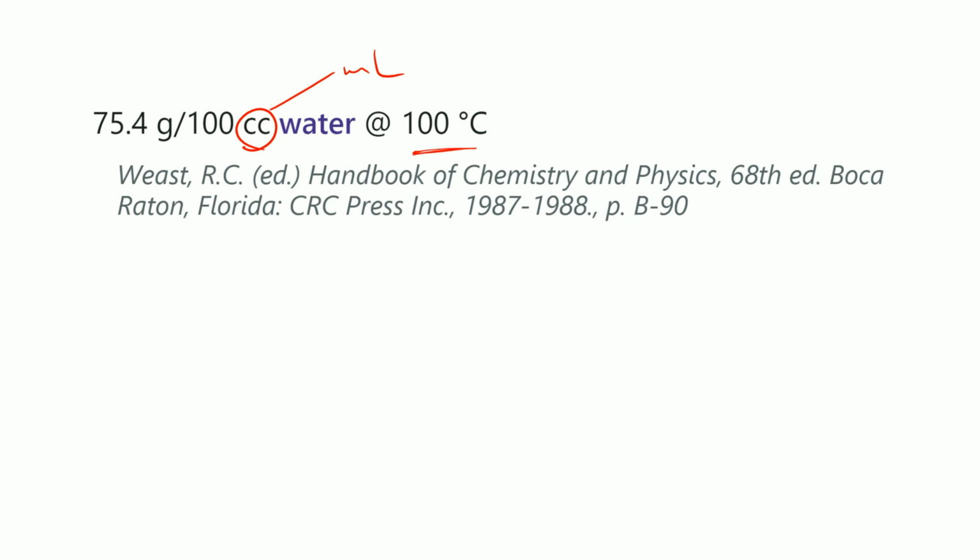Now, 75-ish grams will dissolve at 100 degrees Celsius in 100 mils of water. I'm not going to have 100 mils. I'm going to have 75 mils, as mentioned just earlier. Rather than weighing out 75 grams, could I use less of the salt? And yes, I can.